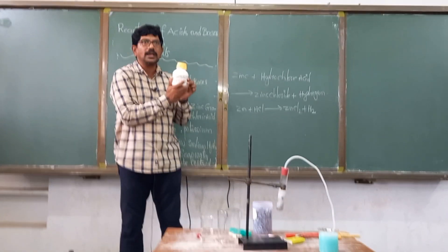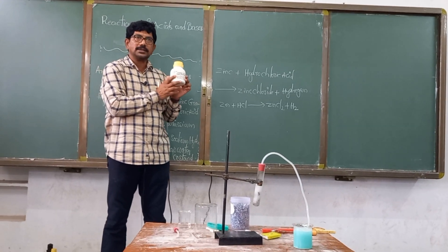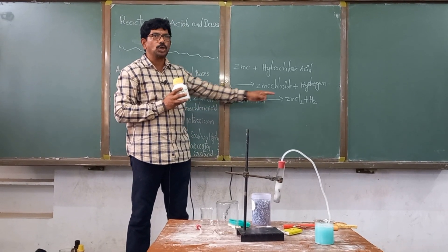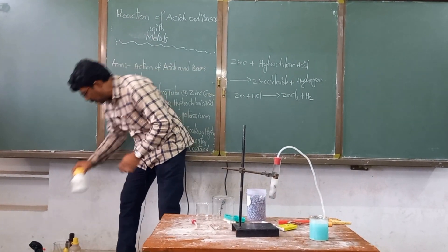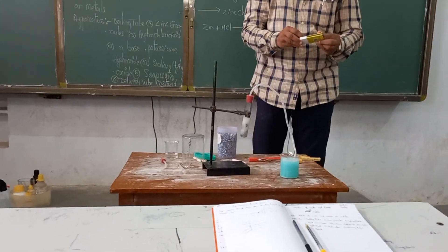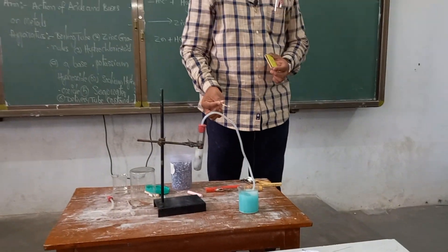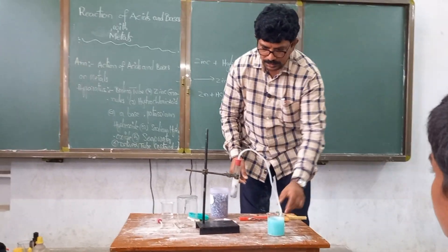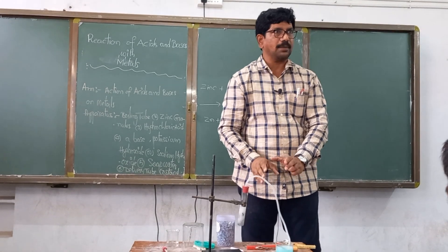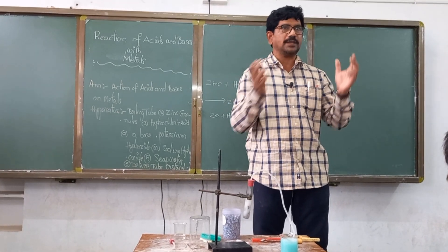Potassium hydroxide pellets dissolved in distilled water give potassium hydroxide solution. What happens when a metal reacts with a base? The same thing happens — it produces hydrogen. Once again I will do this with the base. A lot of gas is formed and bubbles are produced. I am doing another experiment by taking a base. The metal is the same — zinc. In place of acid, I am taking a base: potassium hydroxide, or you can take sodium hydroxide.